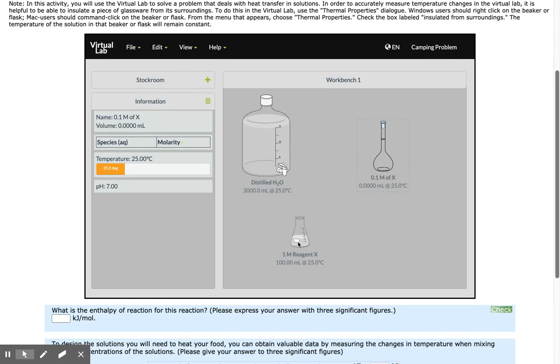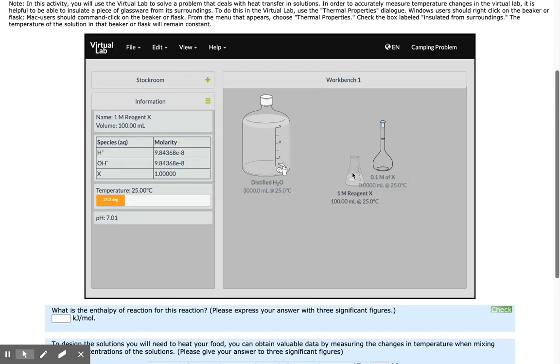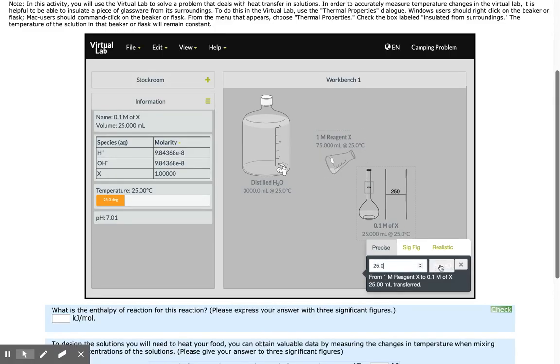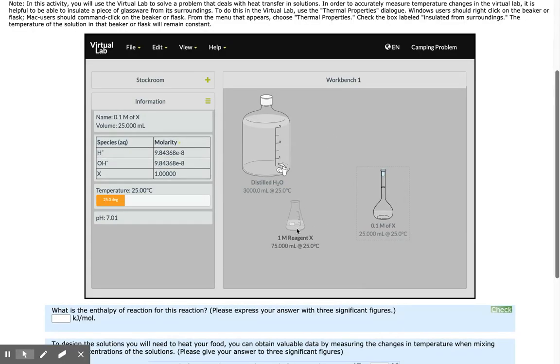From my calculations, I determined I need 25 milliliters of this. I'm going to type 25.0, making sure to include the decimal for precision. Click pour and move it out of the way.